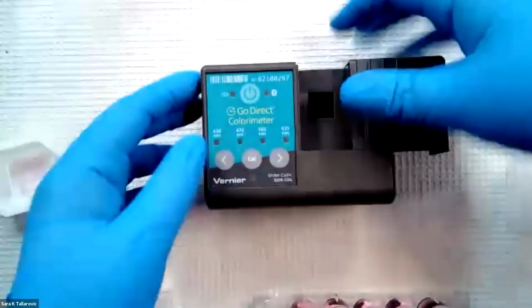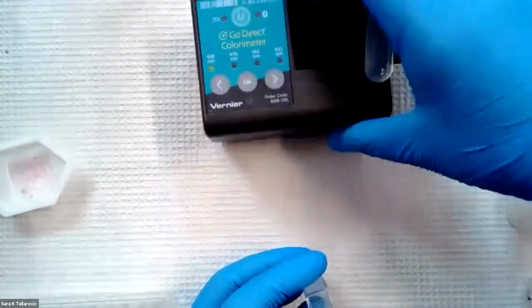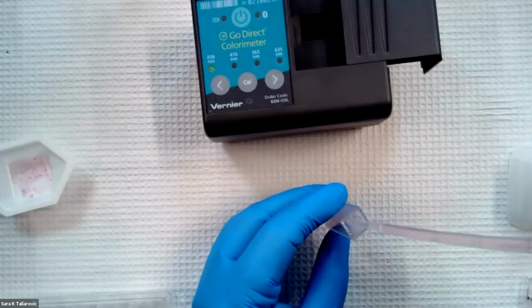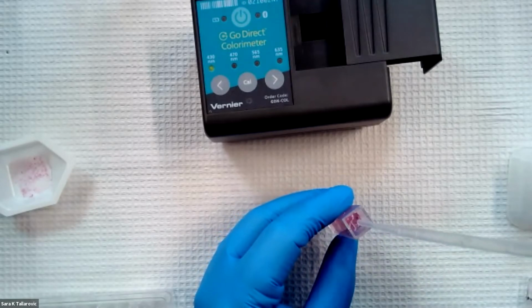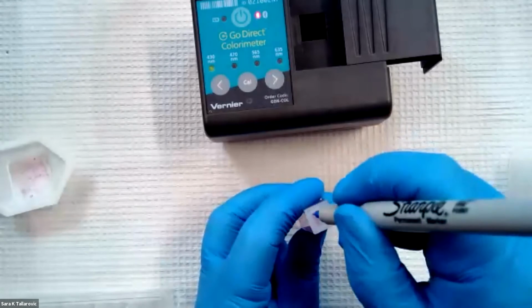So what I'm going to move to is actually, we can start running our samples in Graphical Analysis in just a moment, but I'm first going to prepare our cuvettes. So you want to pipette the liquid in which your sample has been incubating into a clean cuvette. And then I prefer to put a cap on my cuvettes. And this is the 0% sample.